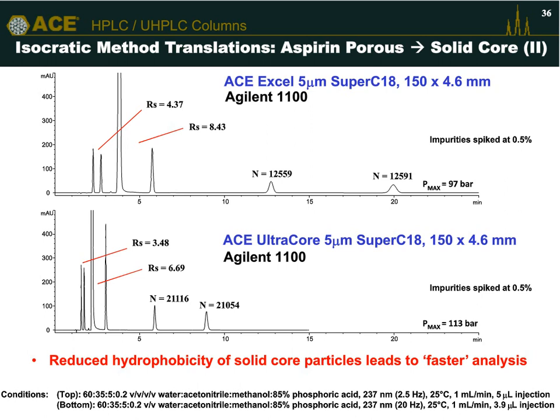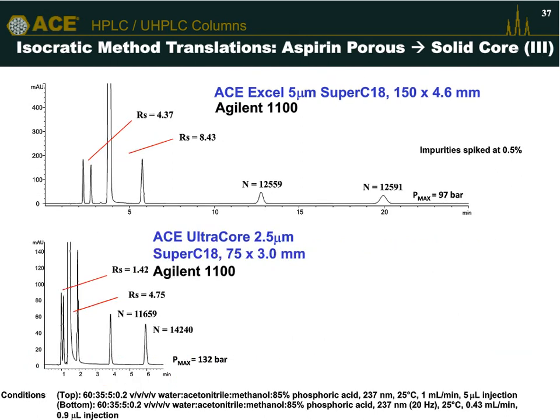And of course, we ask the question, this is now a sub 10-minute separation compared to 25-minute separation. Can we go faster? Of course we can. We can translate the method to shorter column dimensions. However, we hit a problem.